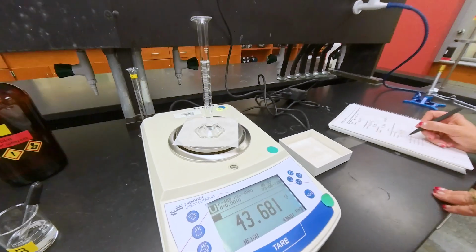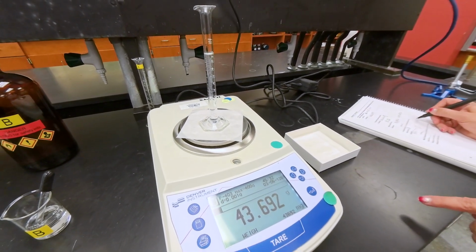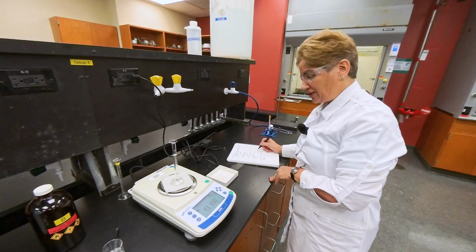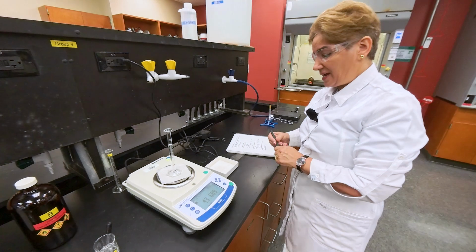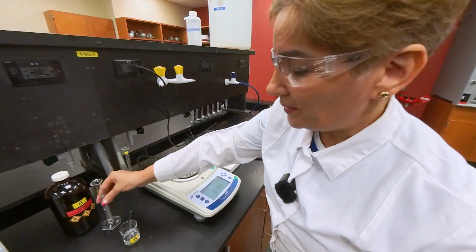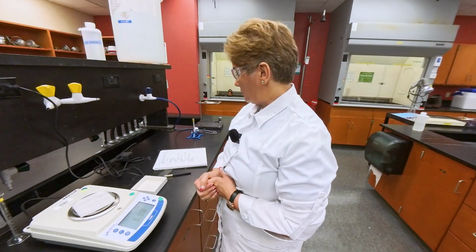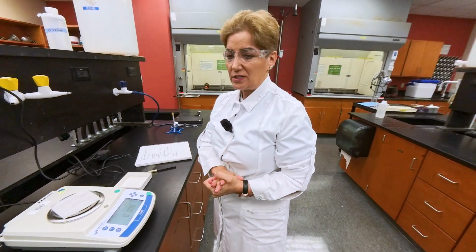This mass is the mass of the liquid plus the sample. See, it fluctuates because the pressure of the air can affect the liquid. It's an unknown liquid, and it can evaporate over time. So when it's stable, you record the number that you saw. It's close enough to the actual mass. This is done. Part 3 is done at this point.